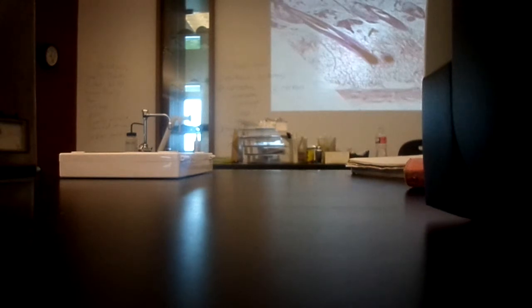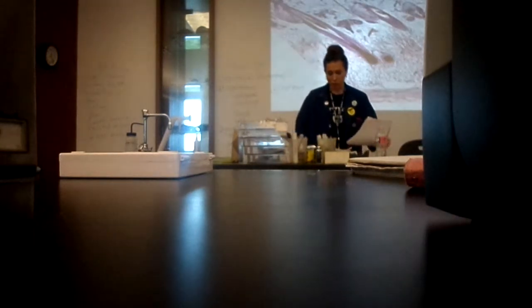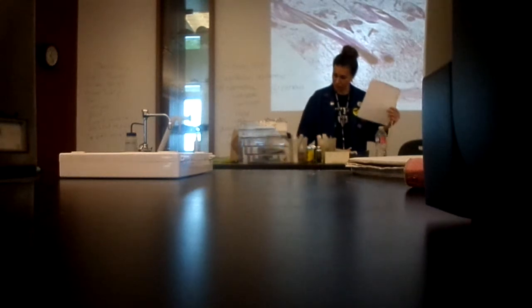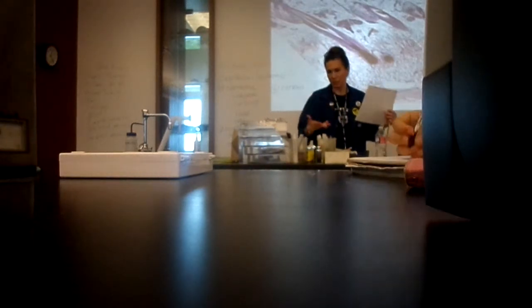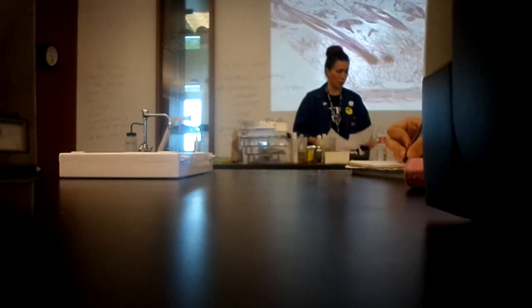All right, the skin is an organ. The skin's the largest organ in the human body, actually. So, 3 layers of the skin. I'm going to show you the 3 layers, and then I'm going to go up on a higher power and look at those layers in a little more detail. This is on your review sheet for Lab Test 3. There is not a picture of the skin slide, but there is a diagram of the skin on page 157. It looks kind of like our model that we have over there.